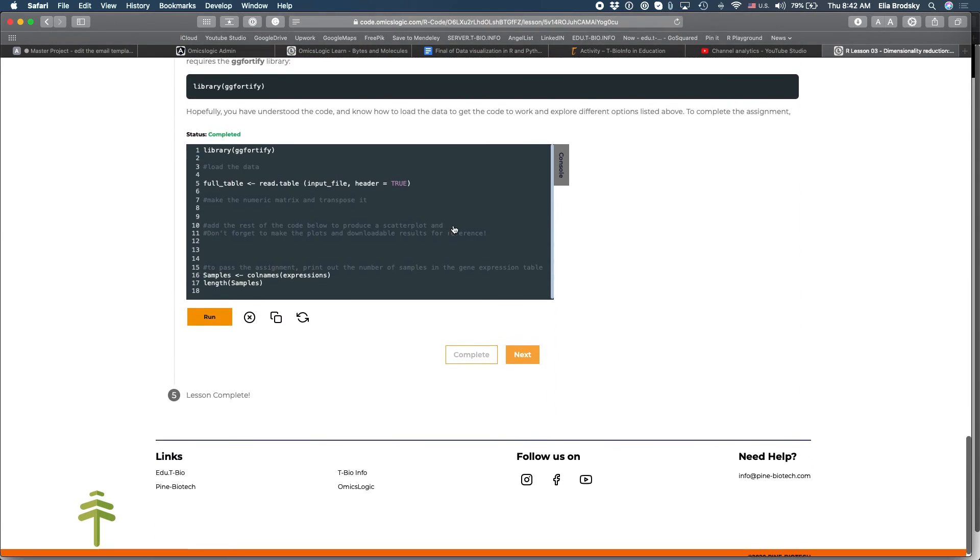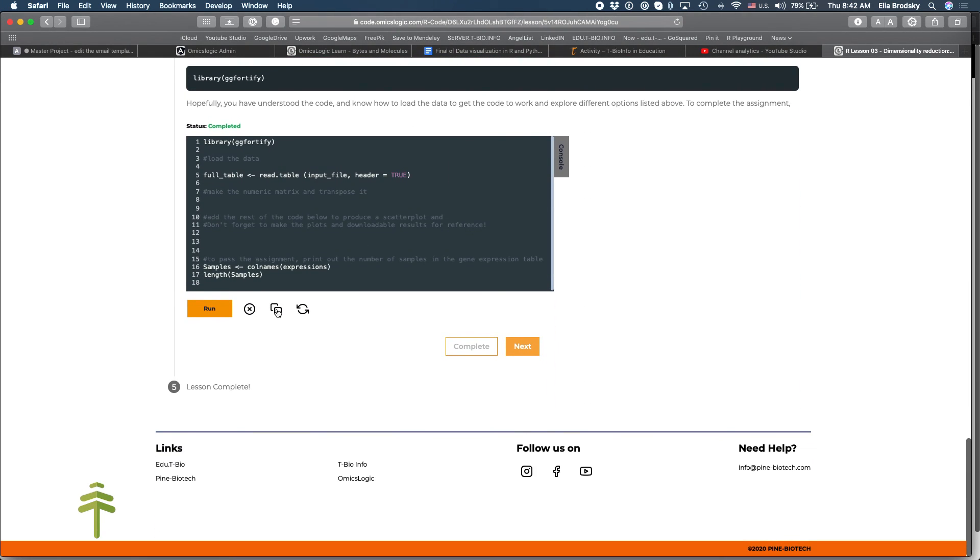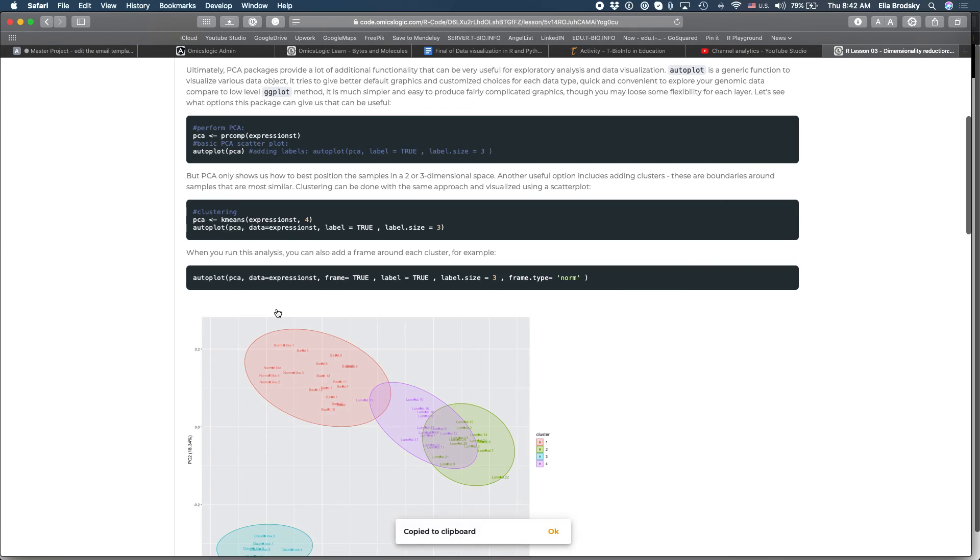Now after you're done you can always copy the code and once the code is copied to your clipboard take it over to R Studio to run it independently, making sure that the files that you use are also saved on your computer.